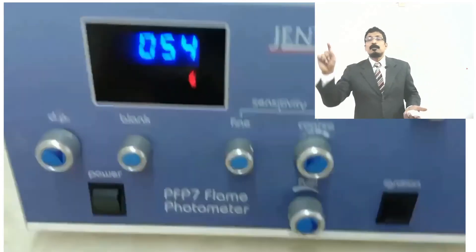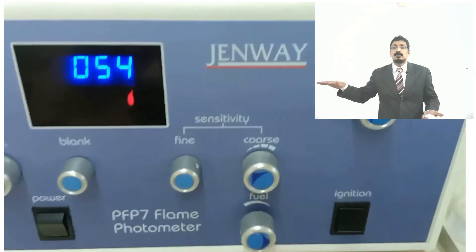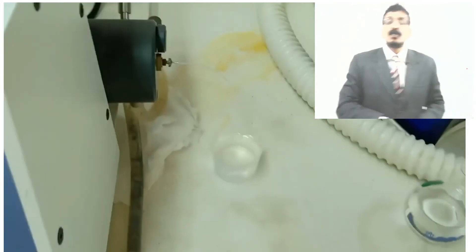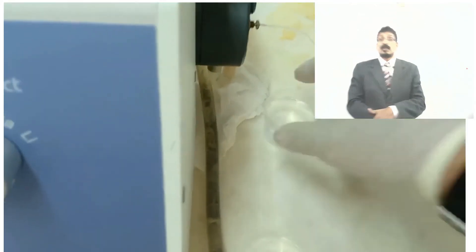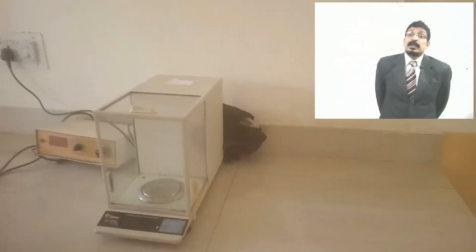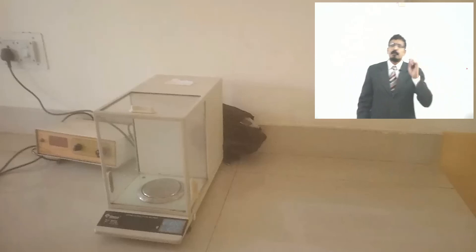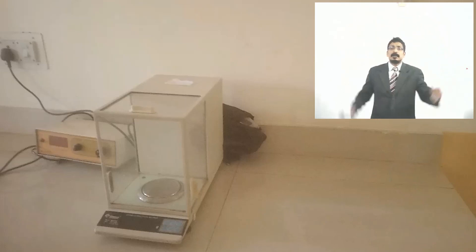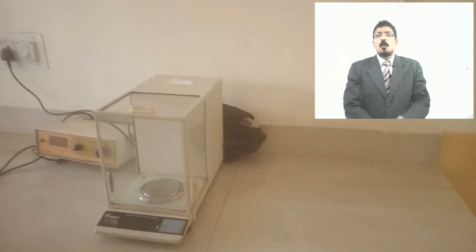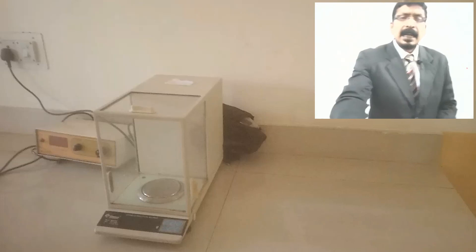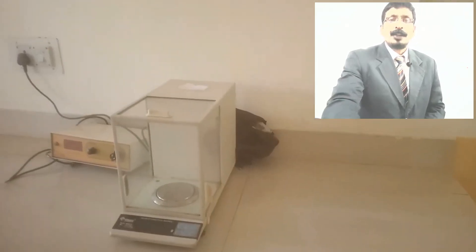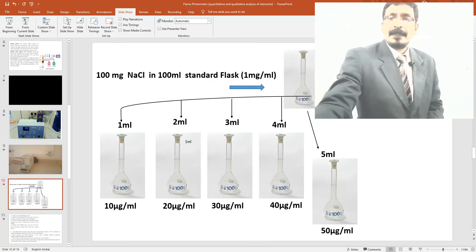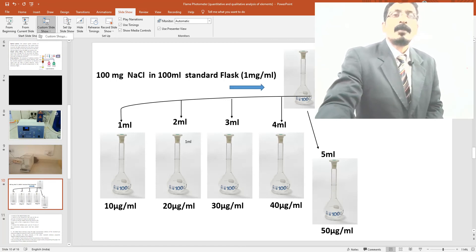Now about preparing dilutions — this is a very important factor in flame photometry. You need a digital analytical balance. Avoid air interference when weighing. Weigh accurately 100 mg of sodium chloride — since we are performing the sodium chloride experiment. This is the dried sodium chloride that you weigh, and then proceed to make dilutions.